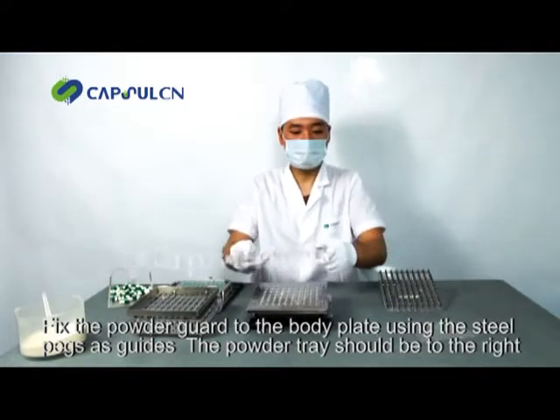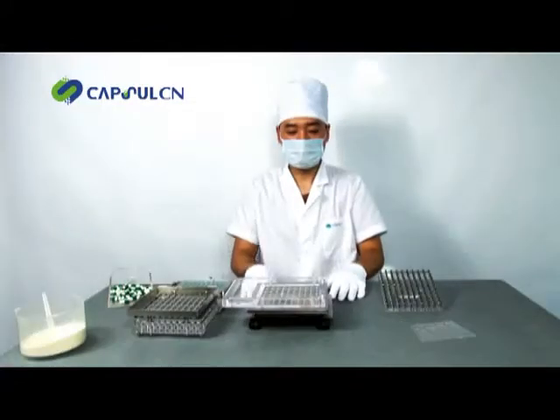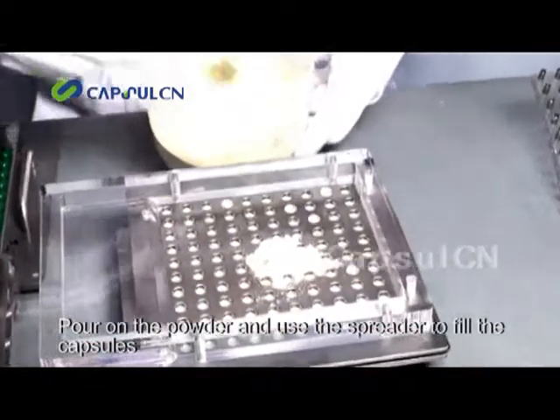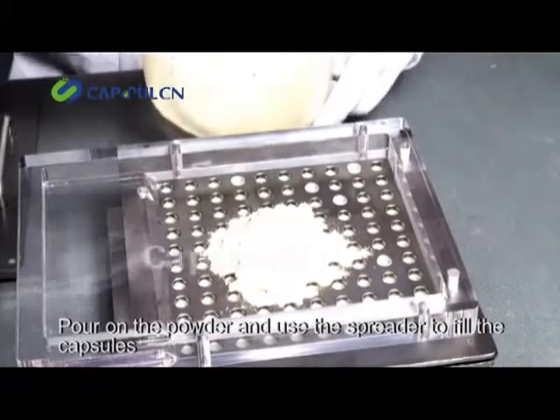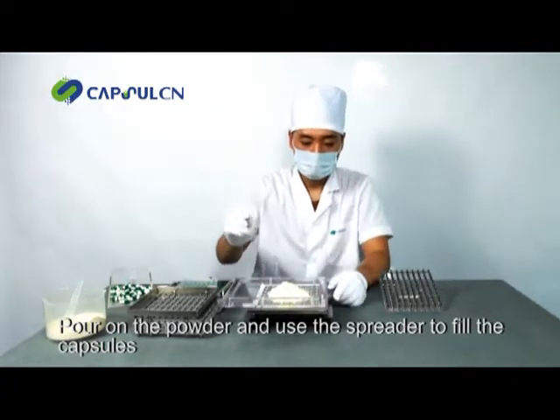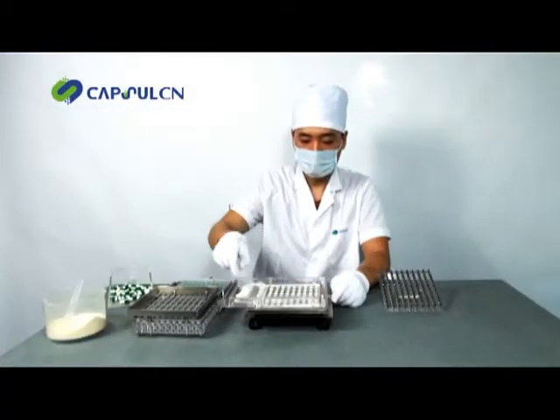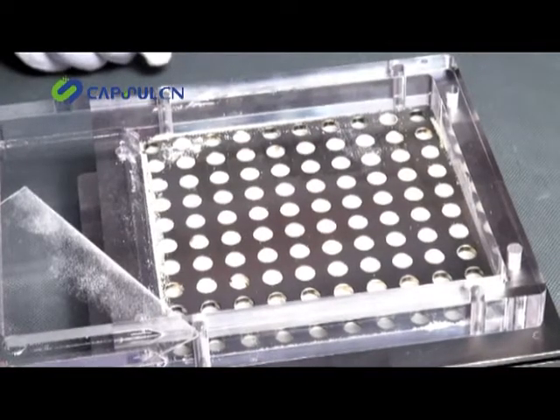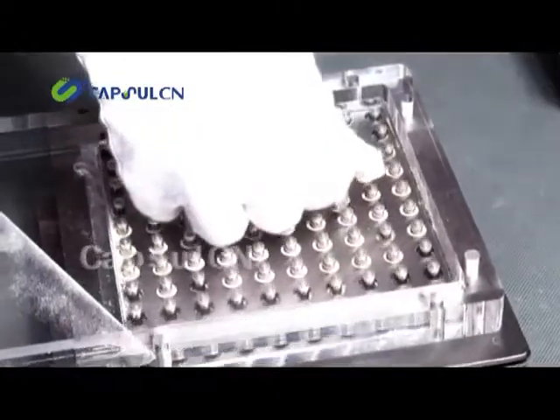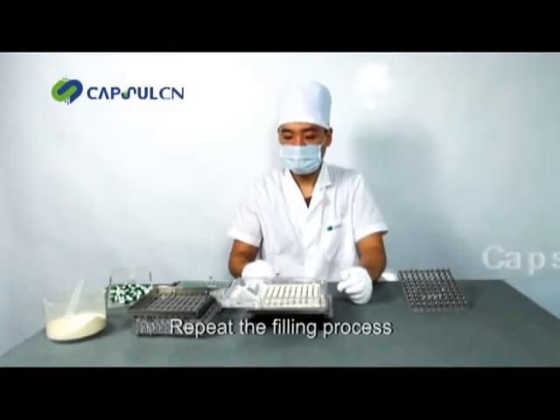Fix the powder guard to the body plate using the steel pegs as guides. The powder tray should be to the right. Pour on the powder and use the spreader to fill the capsules. If the capsules are not full, take the tamping tool and compress the powder, then repeat the filling process.